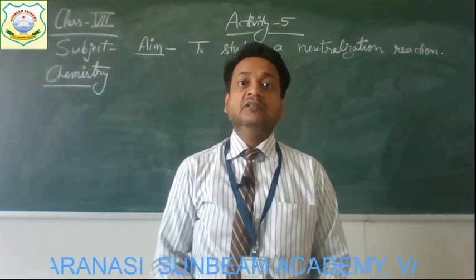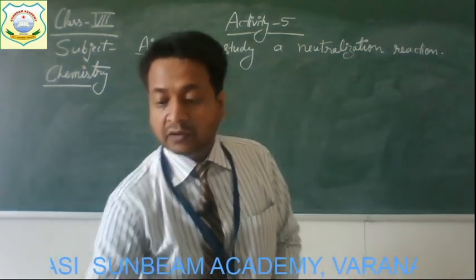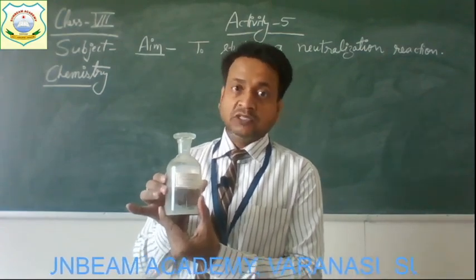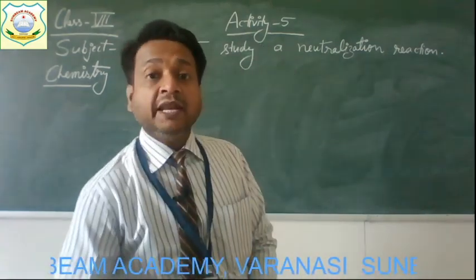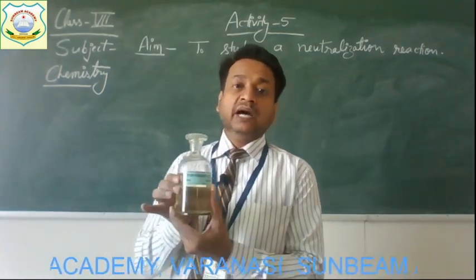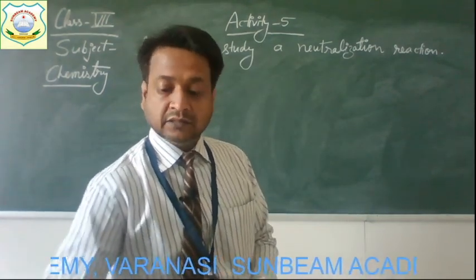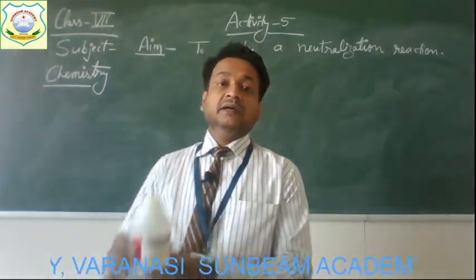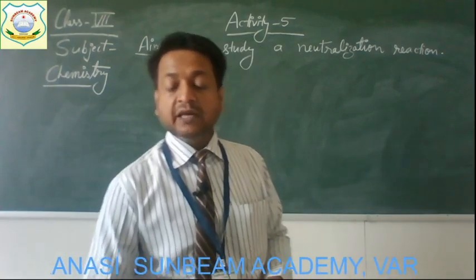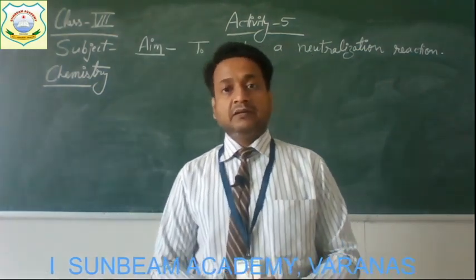For this activity, the materials which we require are a base, that is sodium hydroxide solution. We require an acid. So here I have taken dilute hydrochloric acid. We require an indicator. So here I have taken the phenolphthalein indicator. And we require some test tubes and a burner.